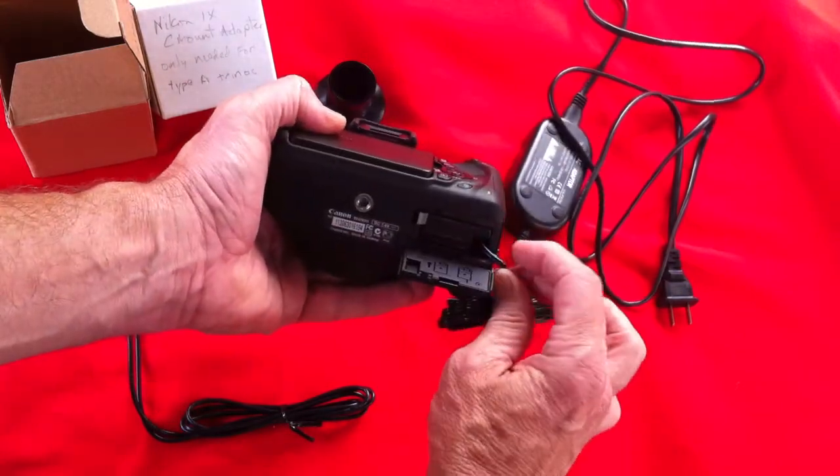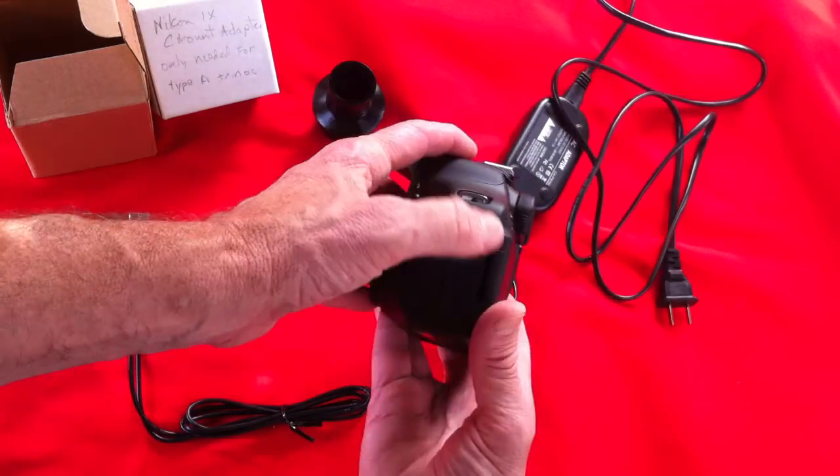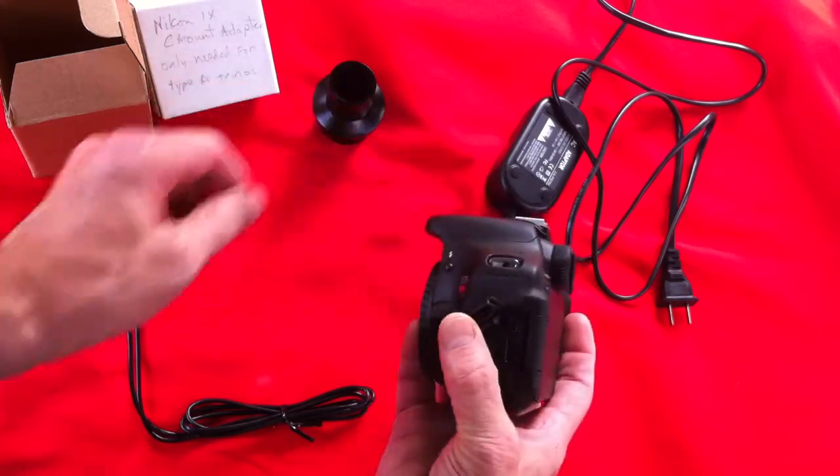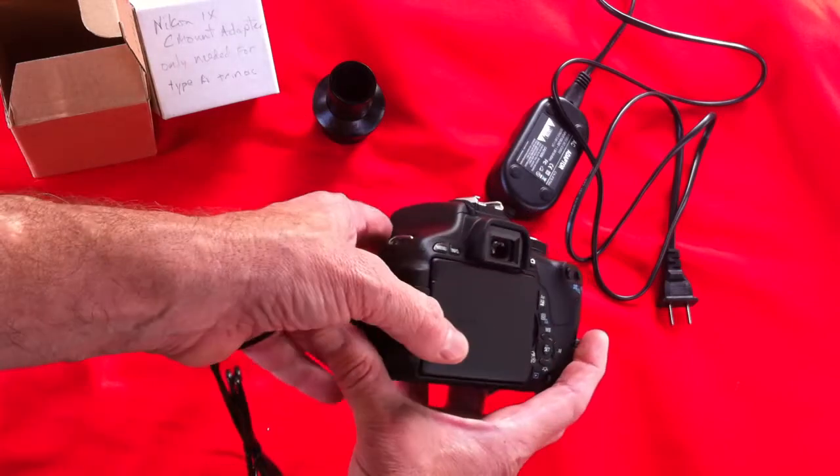The cable goes out through that little rubber port on the side so the door shuts all the way. On the other side of the body we'll put in the USB mini that will connect to the computer.